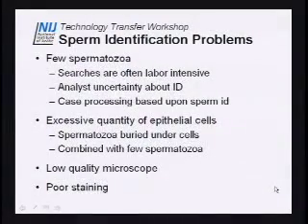You may also have a poor or low quality microscope. I was at a college the other day looking through their microscope. I said, oh my God. I was trying to look at something, and I really couldn't see a lot of detail in a student level microscope. The light source was kind of yucky. The objectives had been through hell in the student microscope. It just was not the quality I was used to looking at.